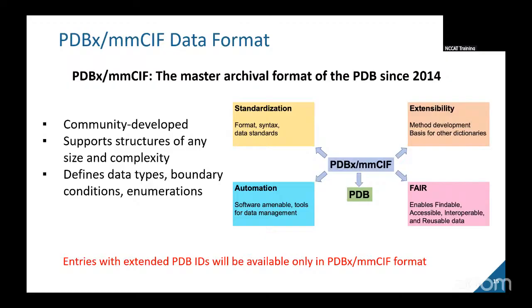The format of the future is PDBX/mmCIF. So why is that a good thing? Well, first, we don't really have a choice. The legacy PDB file format was rigid, with fixed column positions, meaning that when you deposit a model, it's capped at 62 chains and less than 100,000 atoms. That makes it impossible to represent many of today's large cryo-EM structures. And even small molecules will break the format now when they're defined using these new 5-character CCD IDs. So that's one reason we have to move on. The second reason is it will make our lives easier.